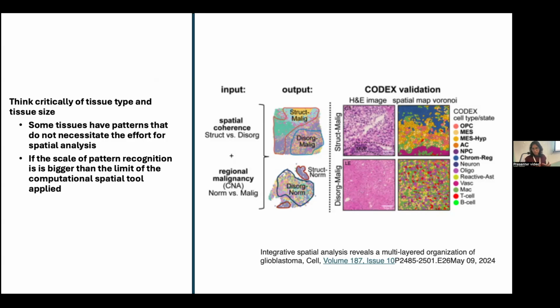It belongs to one domain because the cell types perhaps belong to only a certain subset of all cell types. And the nature of that disorganization means that when you smooth it, the pattern is similar across this region. So it should be able to pick up even a disorganized structure.